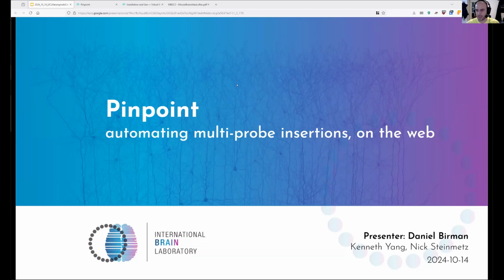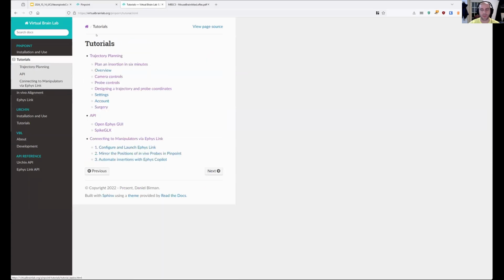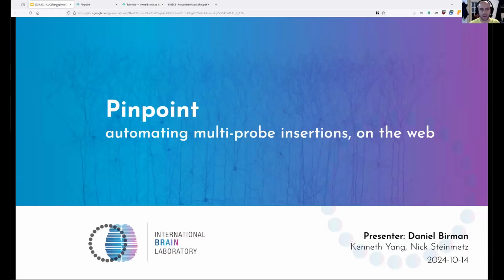So I'm going to tell you in 15 minutes or so about Pinpoint and in general about trajectory planning. I do want to mention right away that a lot of this talk is redundant because we do have a nice website with a whole bunch of tutorials that walk you through almost everything that I'm going to tell you this morning. So do watch those videos and look through those tutorials on your own time. I think you'll find repeats of everything that I say, and hopefully those resources are helpful.